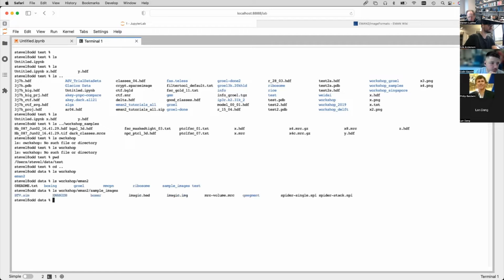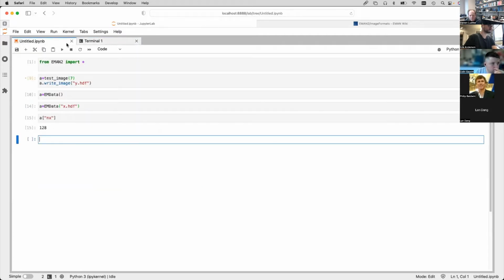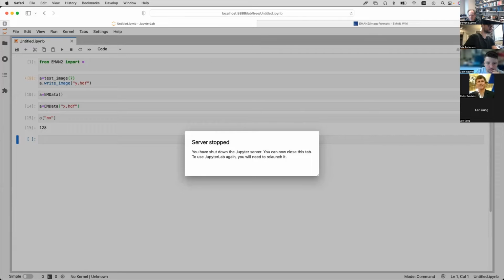Yeah, it opens fine. The TIFF stack's open fine? Yep. Okay, good. All right, so I'm going to go ahead and maybe I'll just completely change where I am. Just a second.